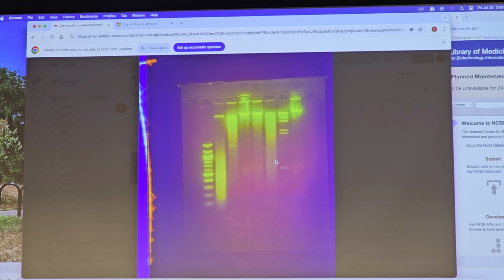Okay, so then we've got this lambda-HindIII marker, we've looked at it before, and then this is the uncut DNA, clearly not digested. There's a little smear here. I don't think that's from degradation. I think it's just because the gel is overloaded with a lot of DNA. And when you can't run in a nice tight band, it just sort of buzzes out. So if the gel's overloaded, you'll get things that look like that. Okay, any questions from this gel?